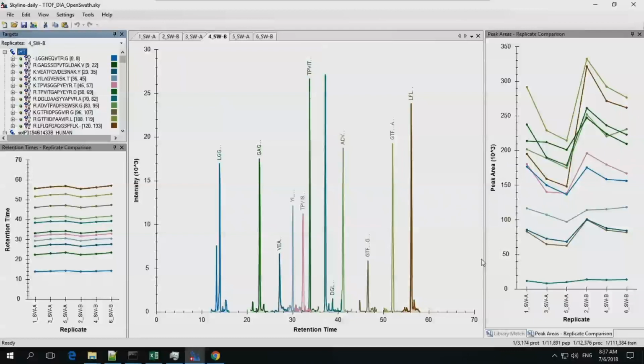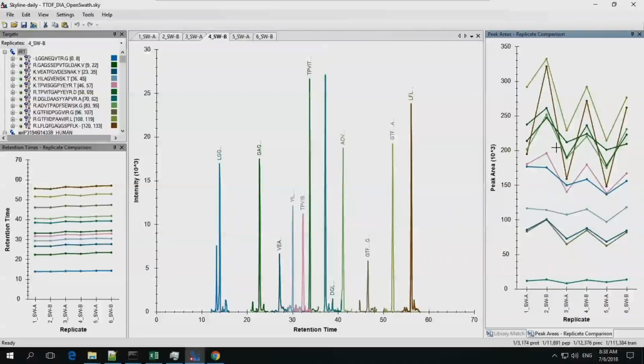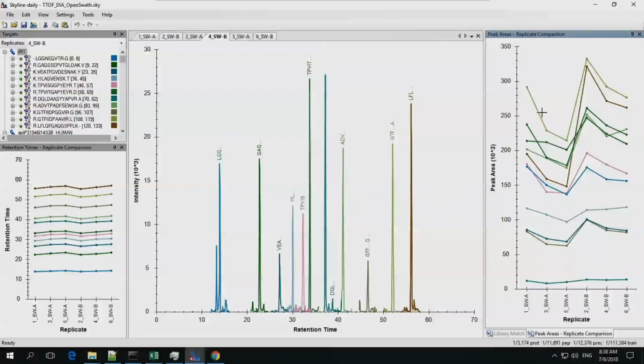If I switch back to not ordered by acquired time, or if I order by document, that's basically the way it was acquired. I can't really figure out anything but sample prep that would have caused what should be technical replicates to look like that, right? But at the same time, when I switch back to order by condition, both sets have a decline. So that may be signal decline on the instrument or something. That's something that might actually go away with normalization.